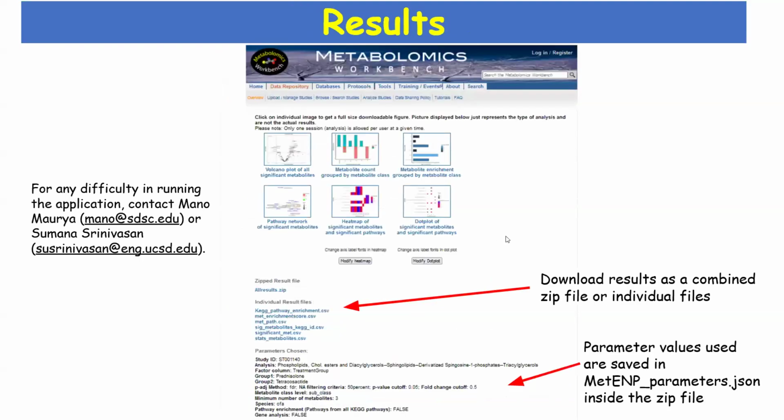It usually takes a minute or two to do all the computations because there are several steps in this analysis. And then on the resulting page, you can click through these plots here. These are just representative images, but when you click them, you get the actual PDF view for these results.